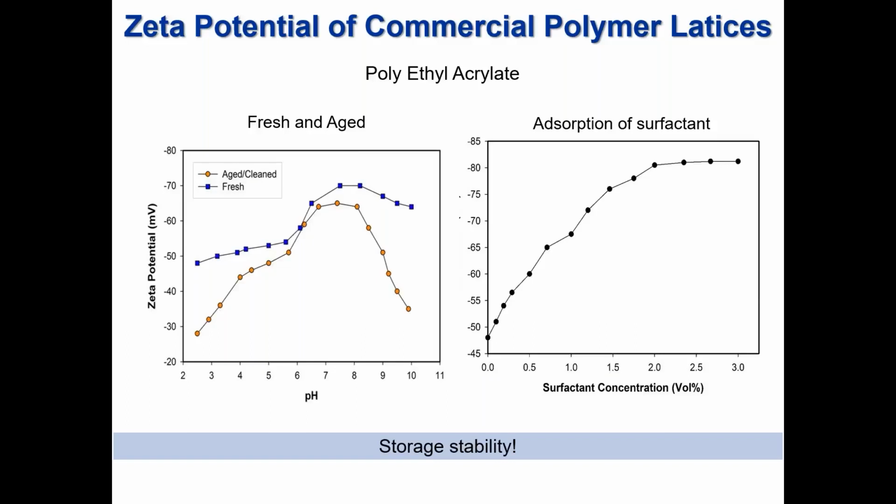This is because zeta potential measurements are made on quiescent systems, i.e. at rest. During formulation and production stages, many suspensions are often subject to shear by pumping or high-speed stirring, or heat, and this additional mechanical or thermal energy is oftentimes sufficient to promote aggregation.